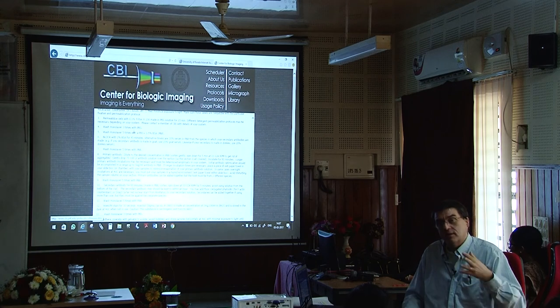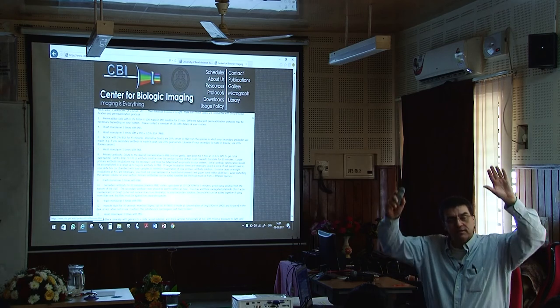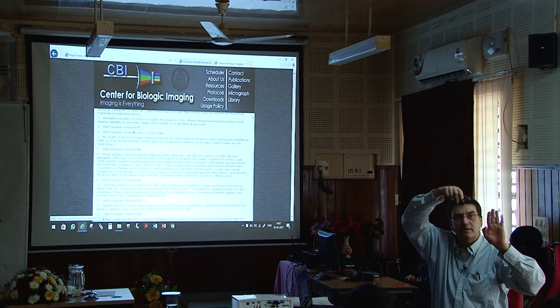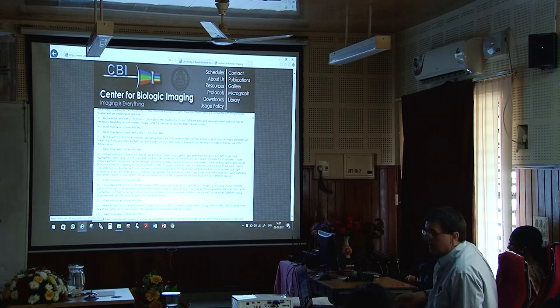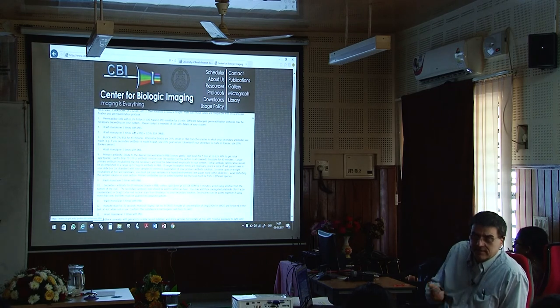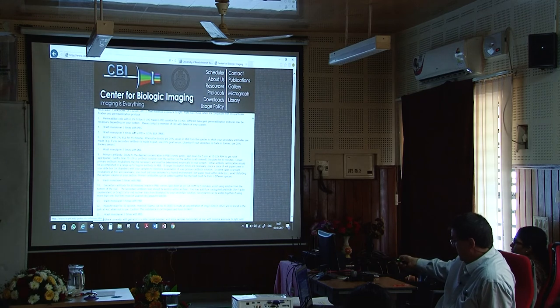I just don't have time to go into all the blocking steps and such, but that will be a problem, because think about it. If you have two mouse primaries and you throw in a secondary red and a secondary green, it's going to stick to both of them. I can't differentiate which one's which, okay? There are ways around that, like we talked yesterday a little bit about mouse on mouse. So what I would do is do a Google search. If that's the situation, like mouse on mouse or primary antibodies from the same host, you can find information on how to deal with a situation like that. Again, after you stain.